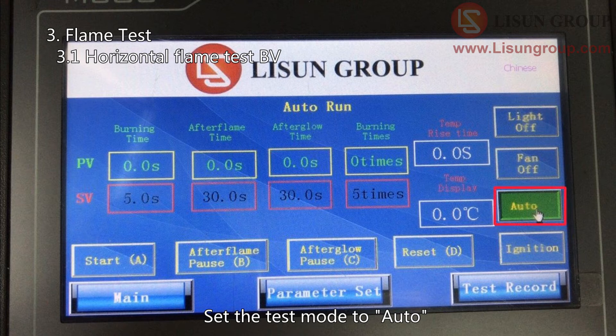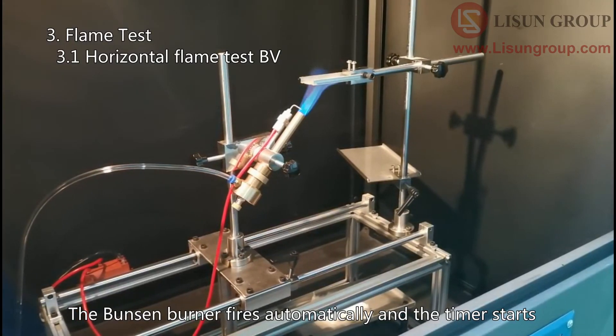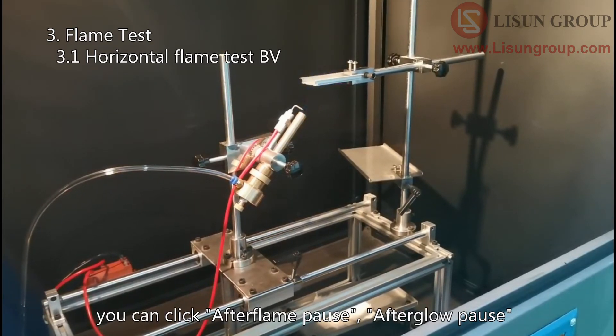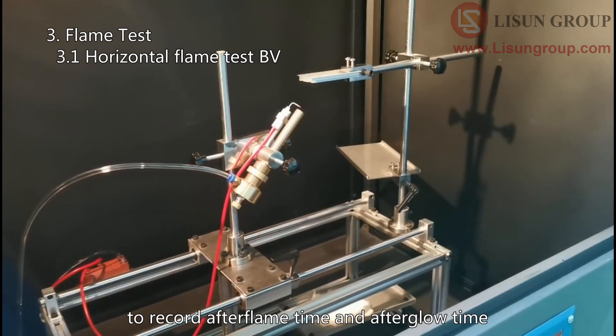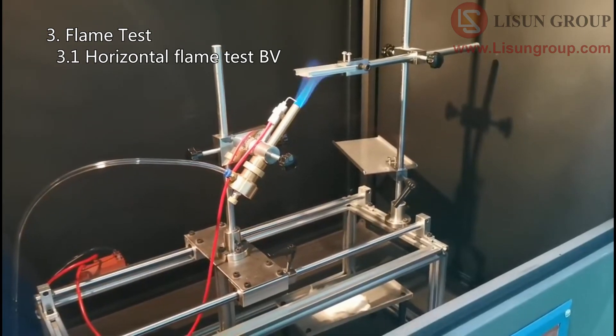Set the test mode to auto. Click Start. The Bunsen burner fires automatically and the timer starts. After each burning time ends, you can click After Flame Pause and After Glow Pause to record the after-flame time and after-glow time. Click Start.